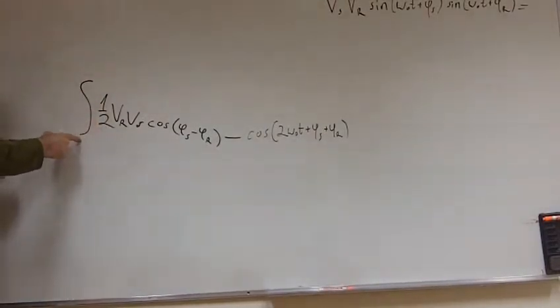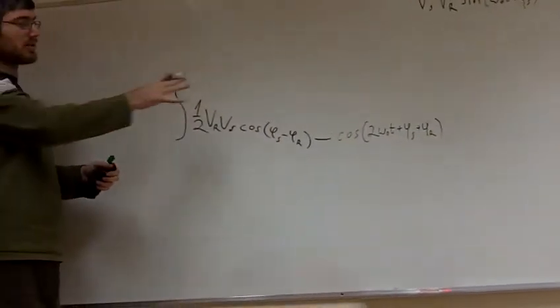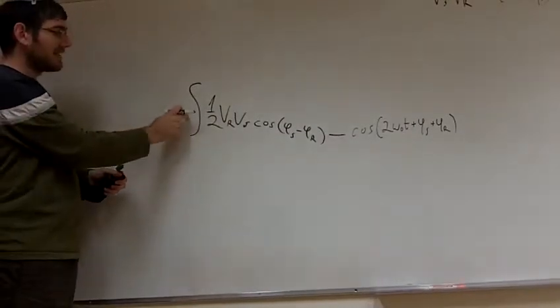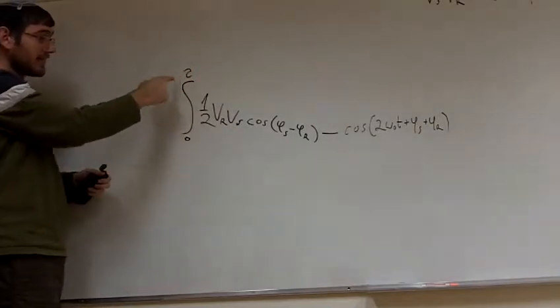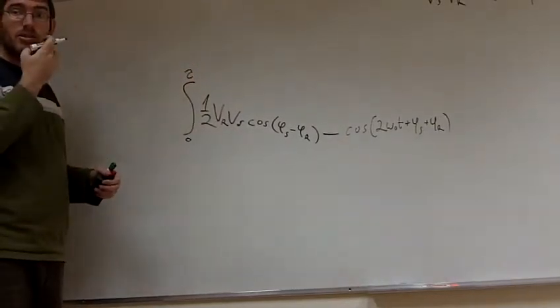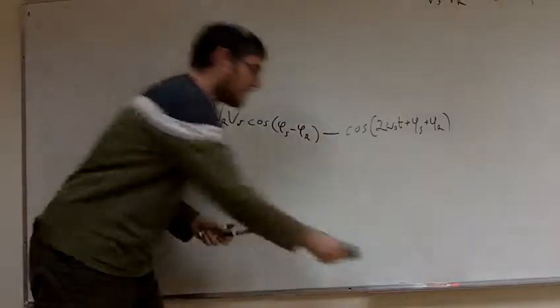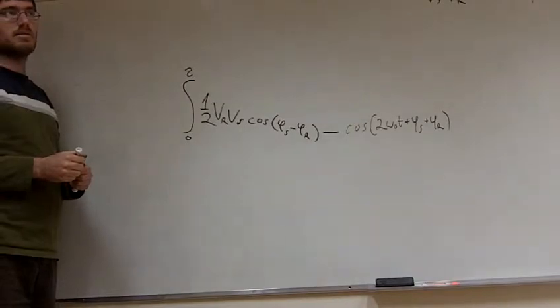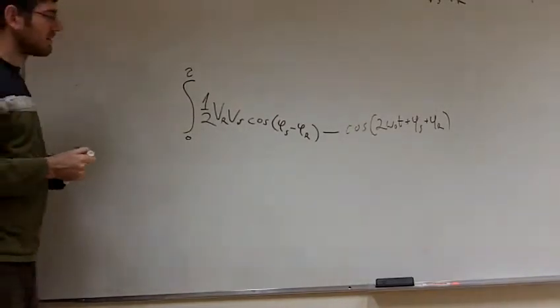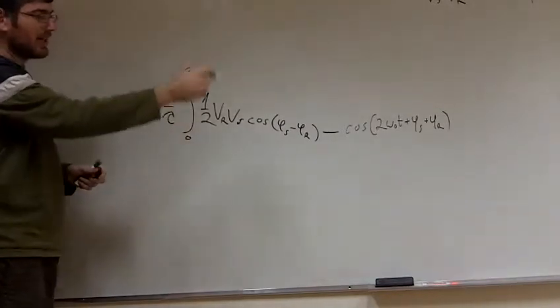And it's important, I'm not just speaking totally theoretically, because in the software we're going to use this. For example, in the software you can choose the integration time, and we're going to see soon why it's important to choose it. Is it integral gain that we are choosing there in the software? No. The gain is a different story. So going through a low pass filter is really integrating this entire term over time.